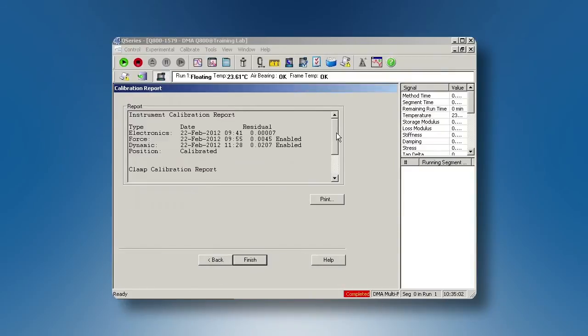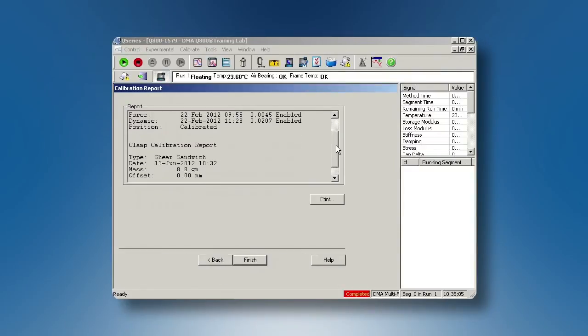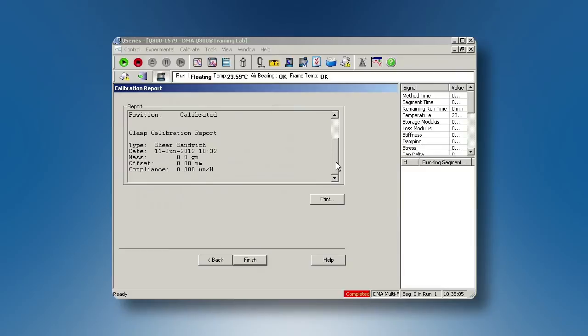View the calibration report from the software. You have now finished the Shear Sandwich Clamp Calibration.